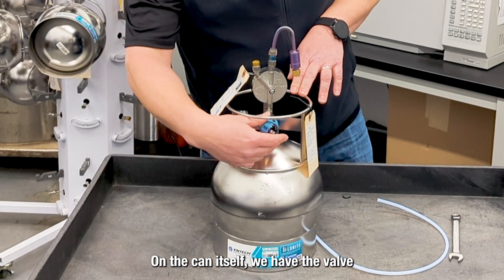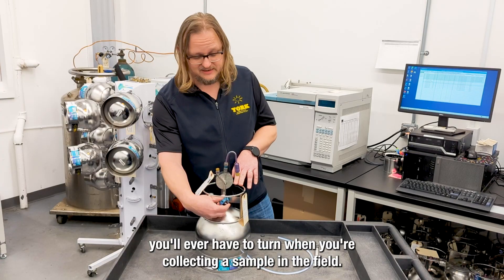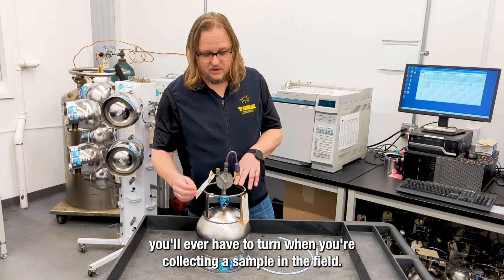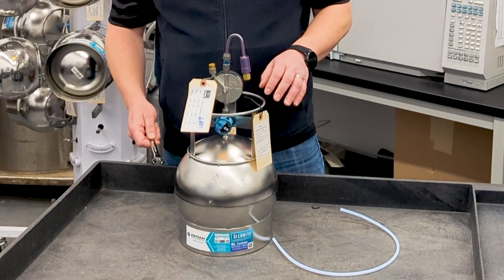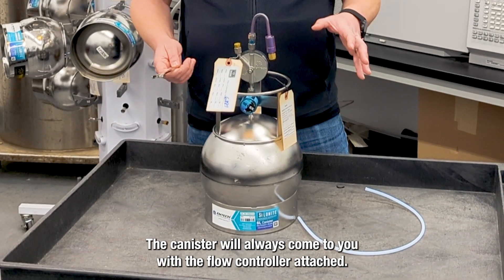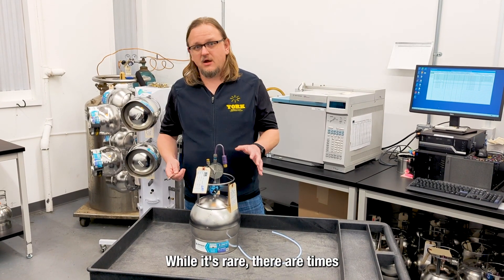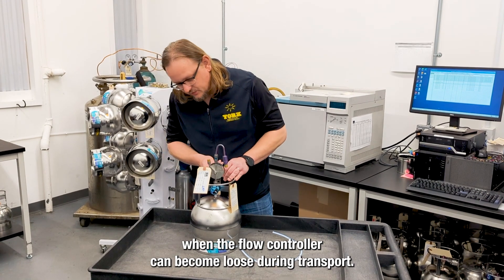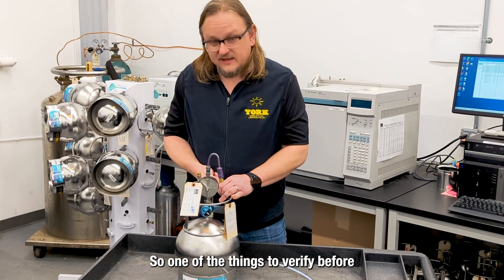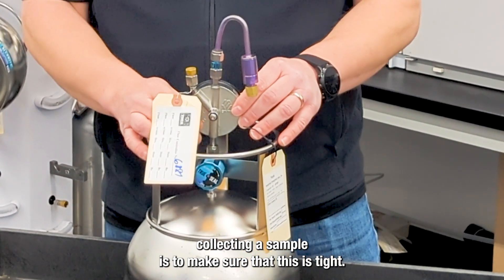On the can itself, we have the valve, and this is the only valve you'll ever have to turn when you're collecting a sample in the field. Normally, when we send these canisters out in the field, the canister will always come to you with the flow controller attached. While it's rare, there are times when the flow controller can become loose during transport. So one of the things to verify before collecting a sample is to make sure that this is tight.